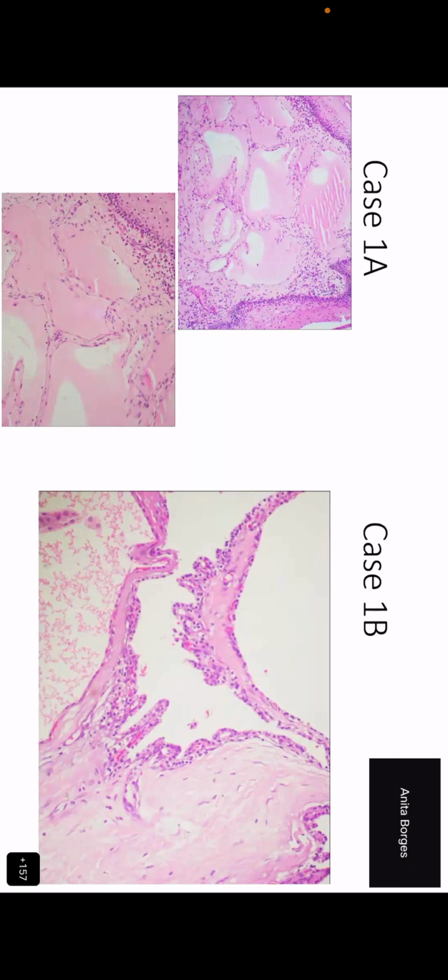Yes, ma'am, but I was telling that it is a lymphatic endothelium, not a vascular endothelium. So what does it matter whether it's lymphatic or vascular space? What's the difference? It's an endothelium, right? Yes, ma'am. So you thought there is some story you have heard that a lymphatic endothelium is discontinuous?